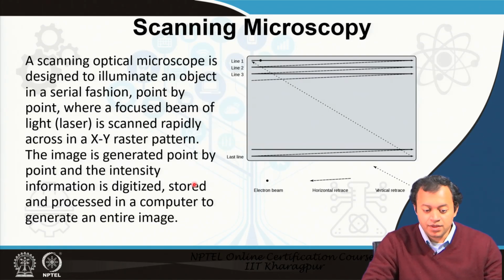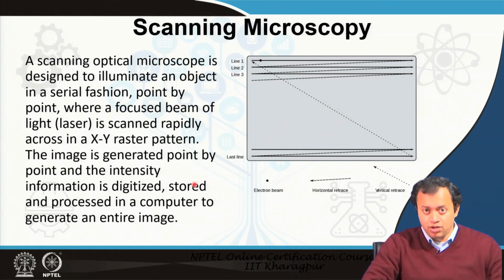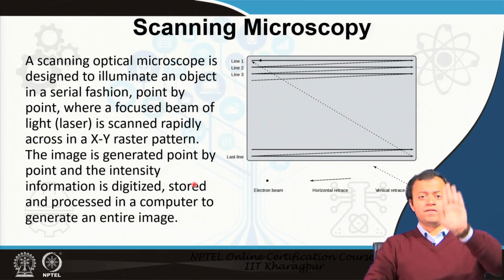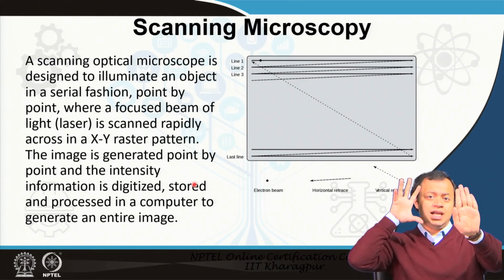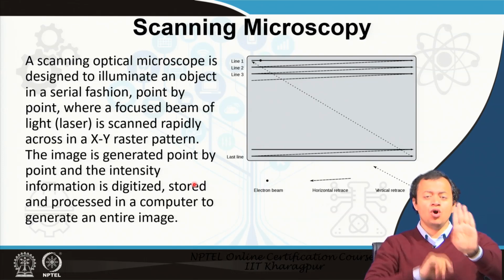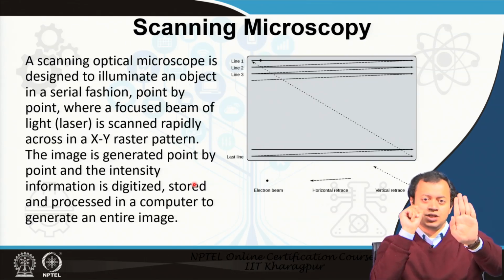So, now comes the most important part, scanning microscopy. So, pay attention, this is going to get interesting. Instead of having a sample and sending a light to illuminate the entire sample, what we can do is scan the sample with a point light source.